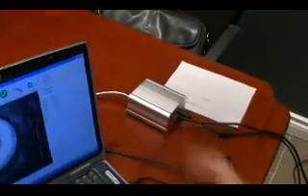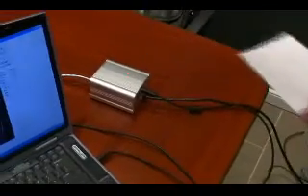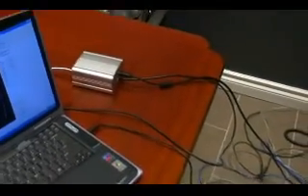It hooks up to a digitizer through this protective cable here, as you can see. The digitizer box is right over here, and that is the box that hooks up to power and to your computer.